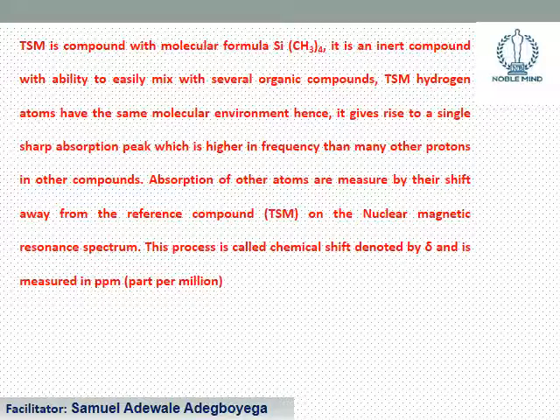All hydrogen atoms in tetramethylsilane have the same molecular environment, so it enables them to give rise to a single peak, a sharp absorption peak, which is always higher than any other protons that you could find in other compounds.